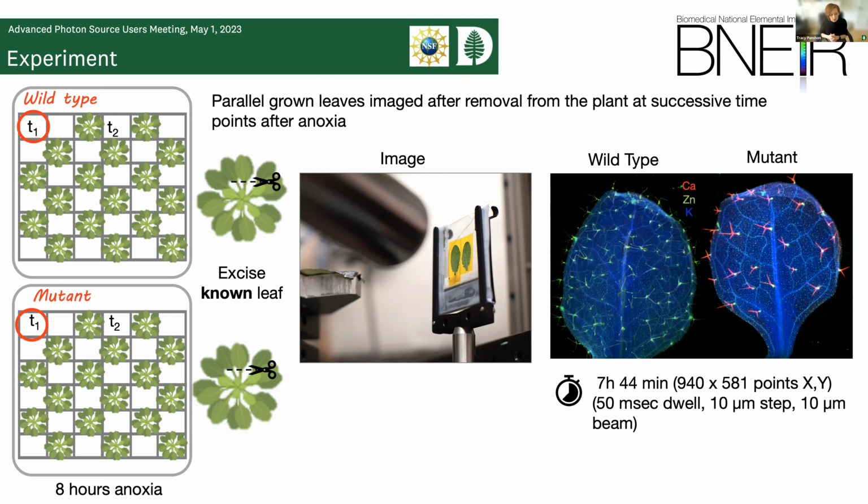So this is what we're left with doing. Plus, it's a different plant every time. We obviously have to image each individual plant. So we've got to find the exact same leaf in that rosette of Arabidopsis, we've got to find that every time and image that exact same leaf.